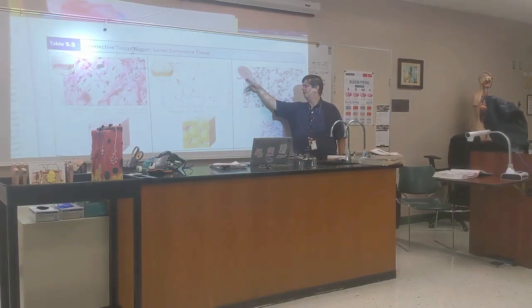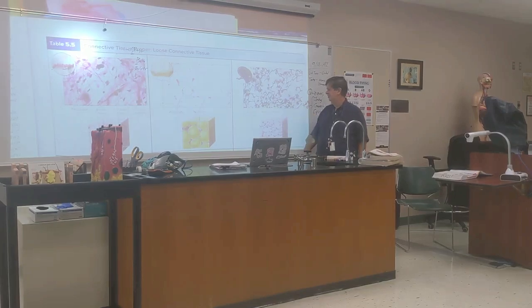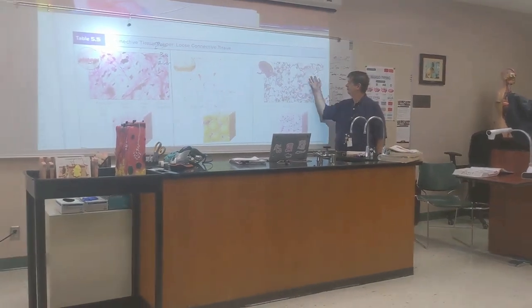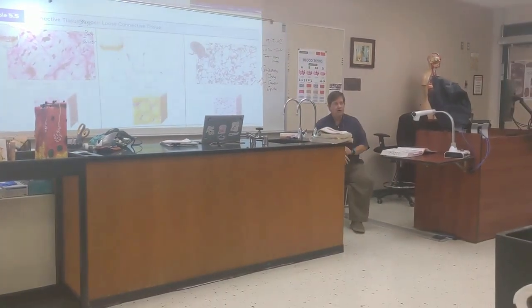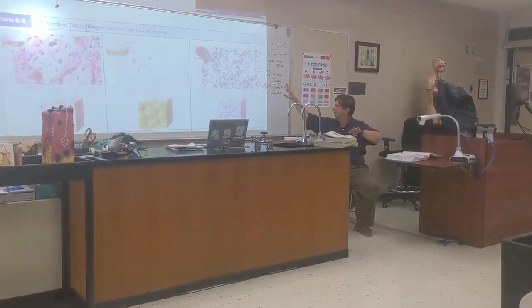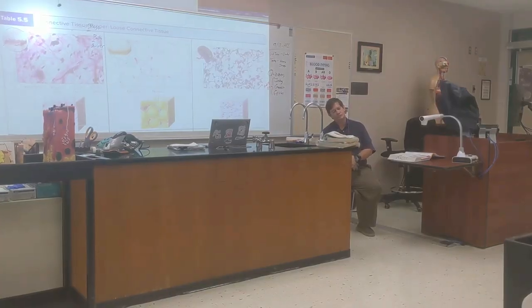This picture tells us this is the spleen, but it could have been part of a lymph node too. But so you have these reticular fibers, you have this space in between, you have these white blood cells hanging out here. You know what's going on there? It's part of the lymphatic system. You got all the lymph going through all that open space, and the white blood cells are sitting there just watching. I know how to explain it.